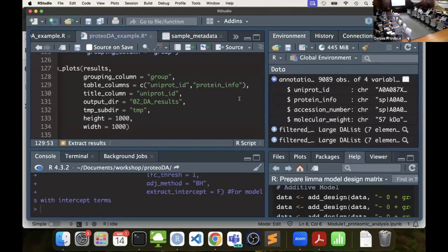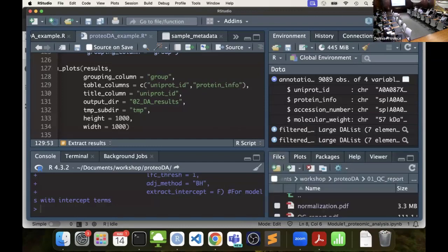to that output. The title column is going to be the bar plot, or the plot that shows up on the right-hand side. If you hover on a dot on the volcano plot, it pops up a new plot, and that's going to be the label for that one. It'll be better if I actually show you what this looks like.